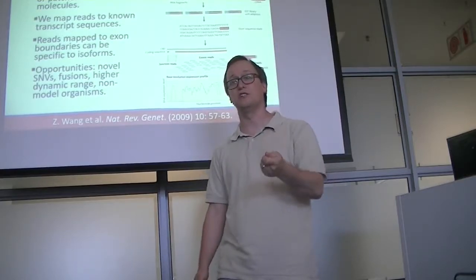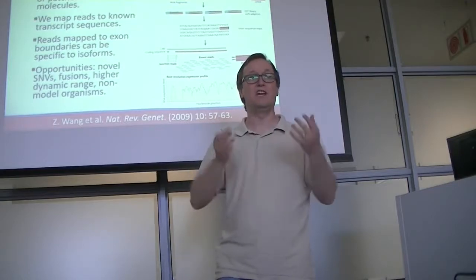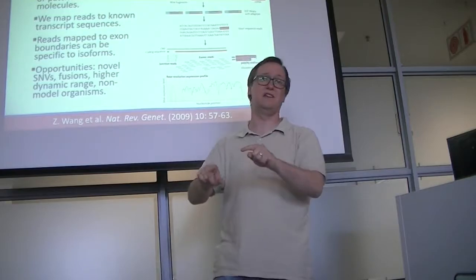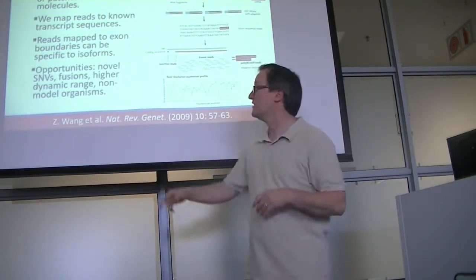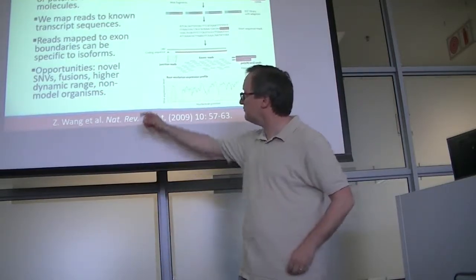It's a lot harder to do in the context of a microarray because, again, you must know what sequences you care about in advance and see that they're on your microarray if you're going to detect them by that method. So certainly people focus on fusions through RNA-Seq experiments.